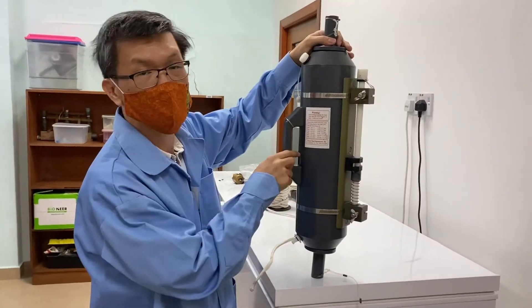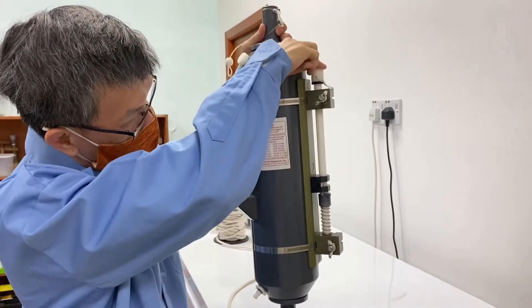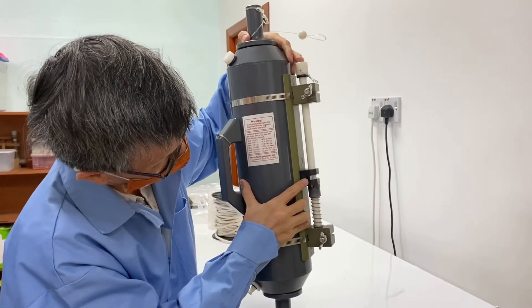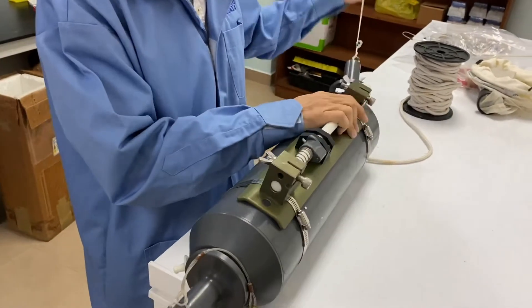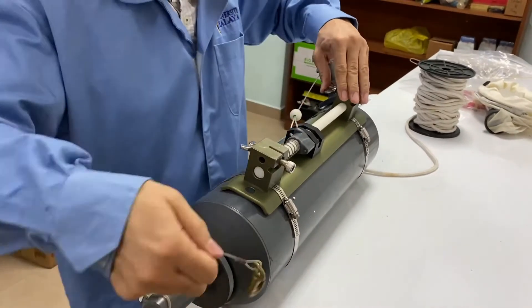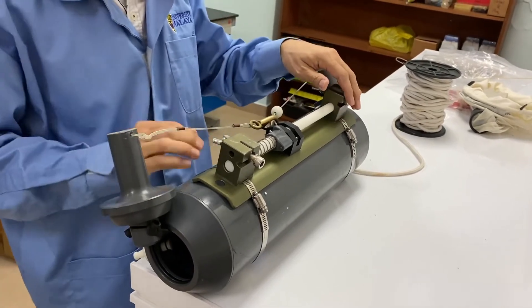This is where the messenger will hit — this is the trigger mechanism. When it hits, it releases the latch. Let's set up the Niskin sampler: latch this into the trigger, and also this here. Okay.